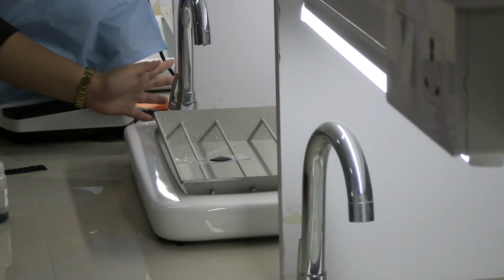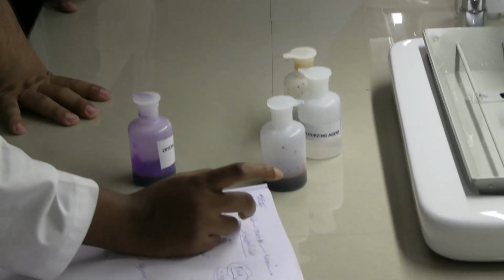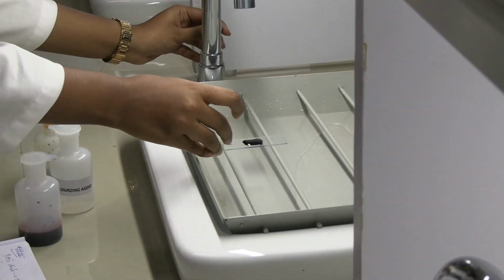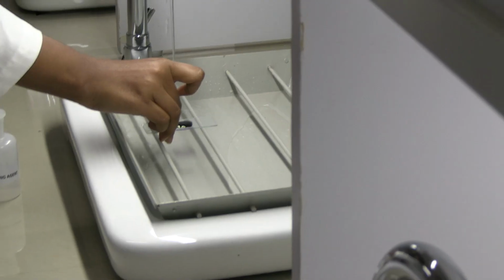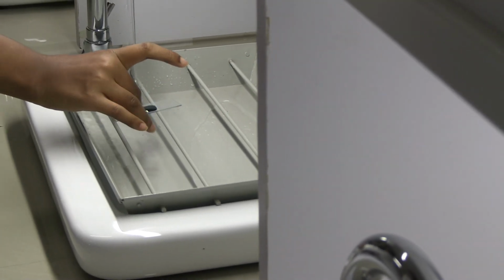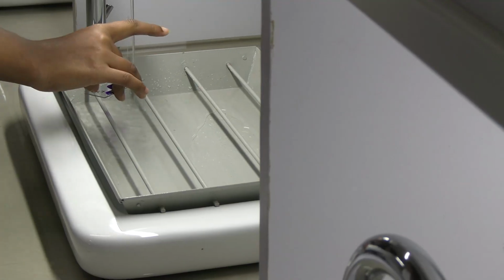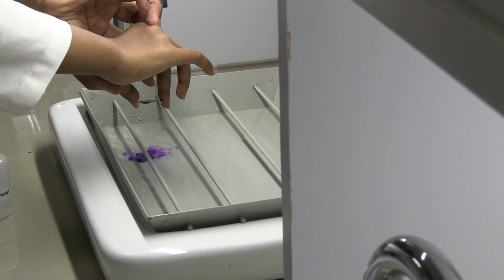If it's 1 minute, then you should wash. So 1 minute. Okay, start. Open the tap a little bit. Take the slide, hold it using the 2 fingers, and let the water drip. Just slant it a little bit. Yeah, slant it a little bit. Put the index finger down.